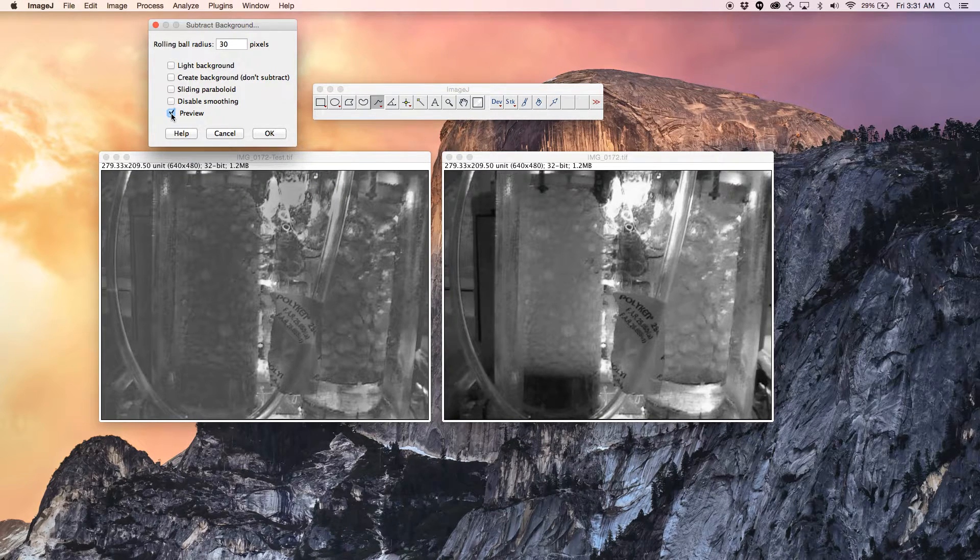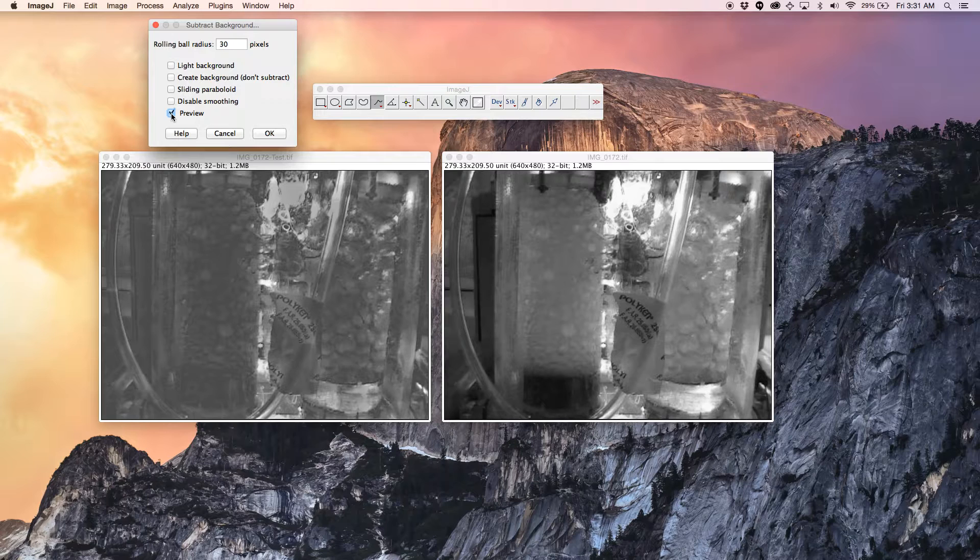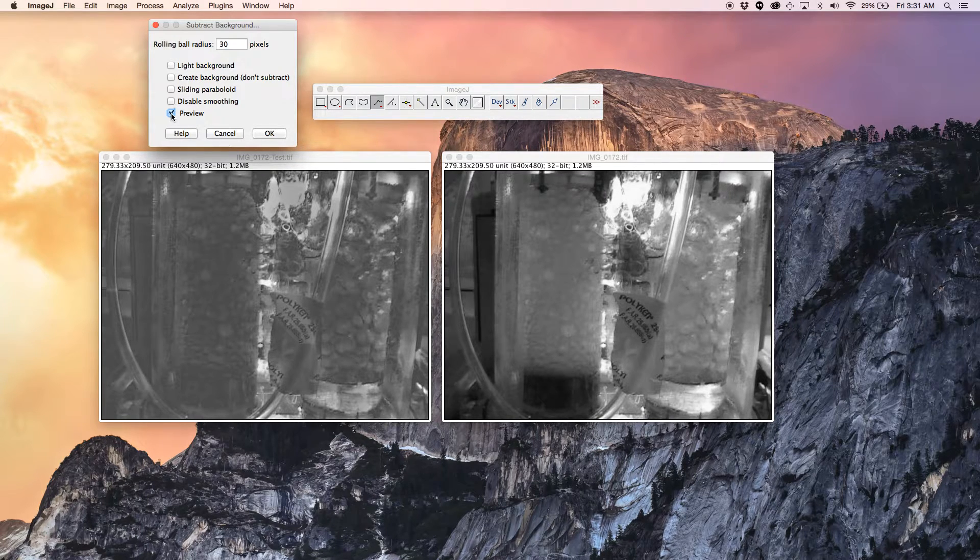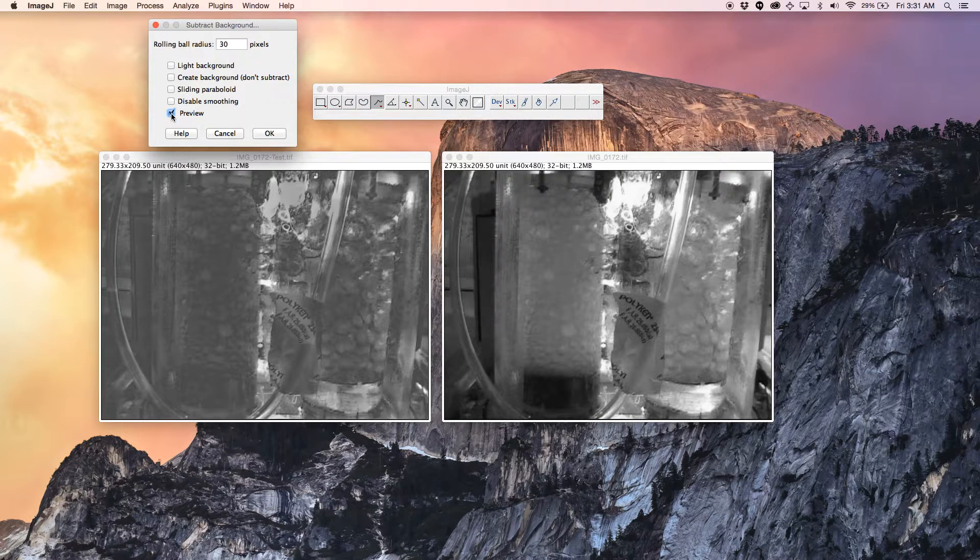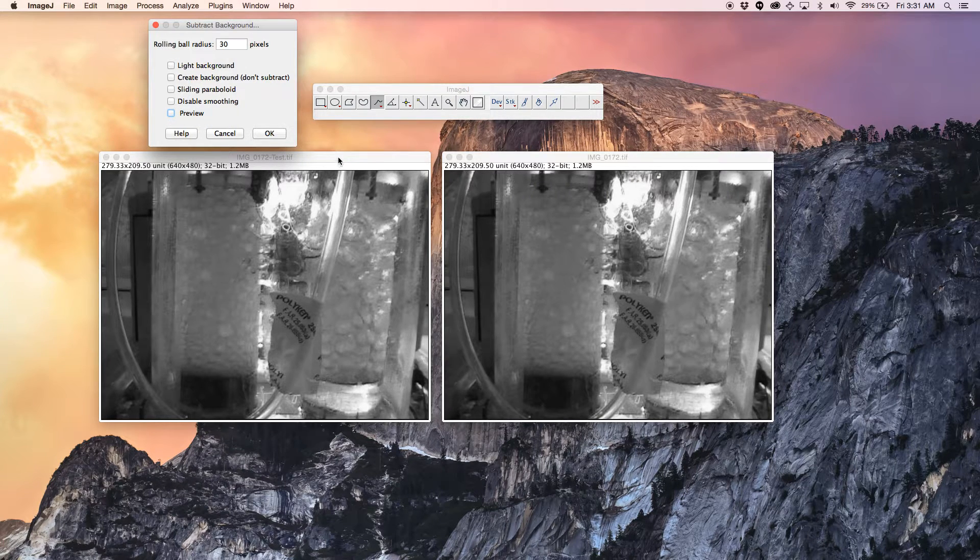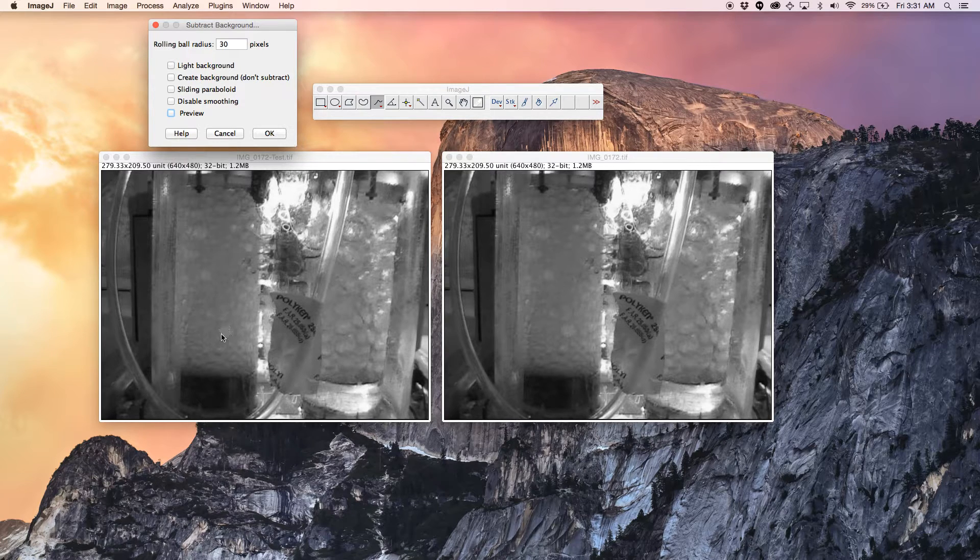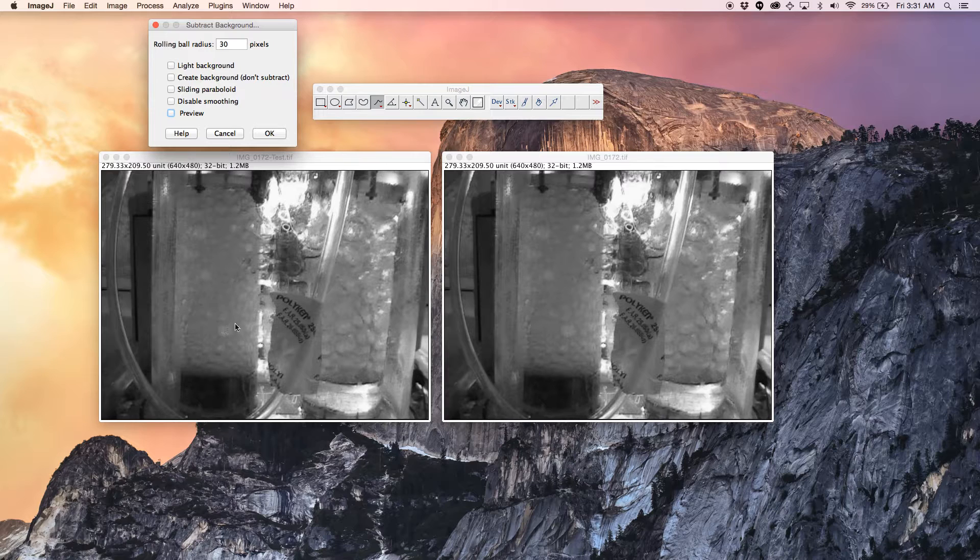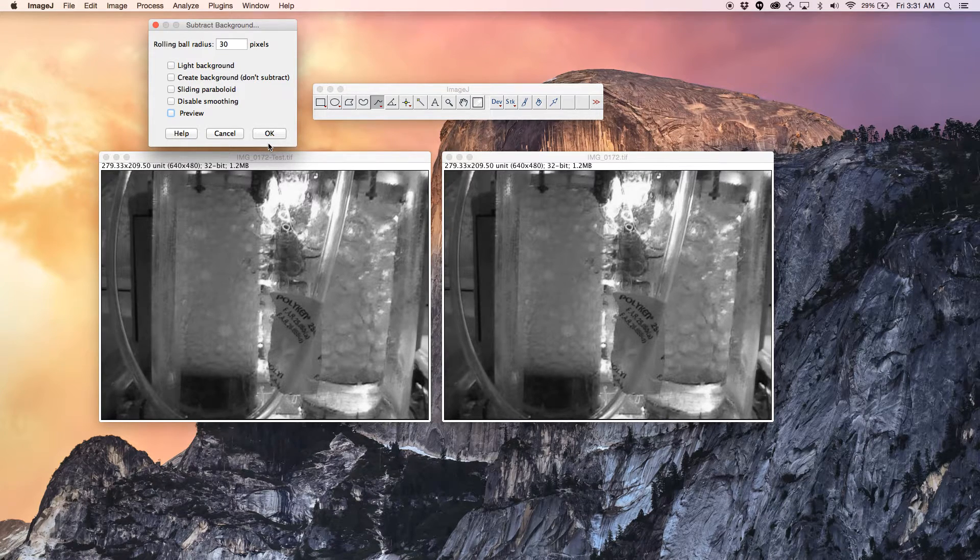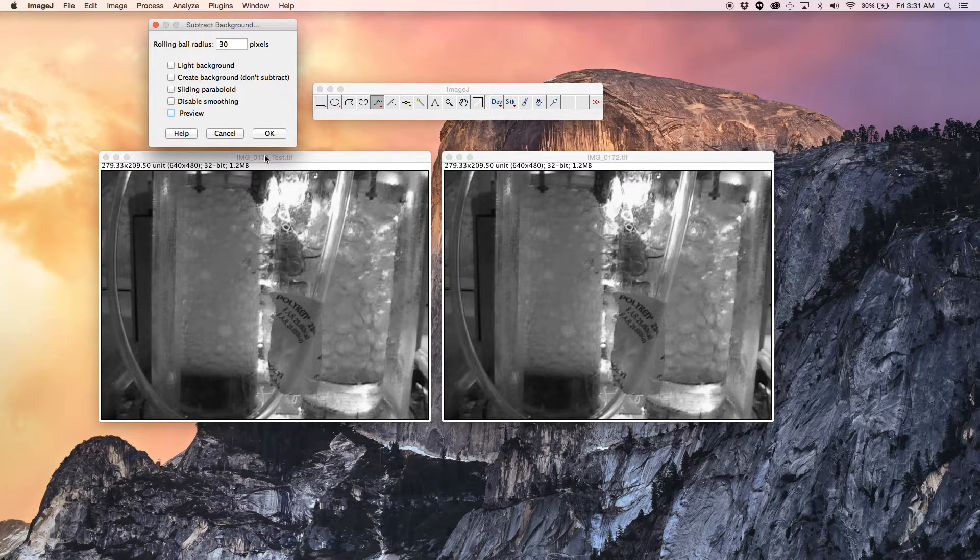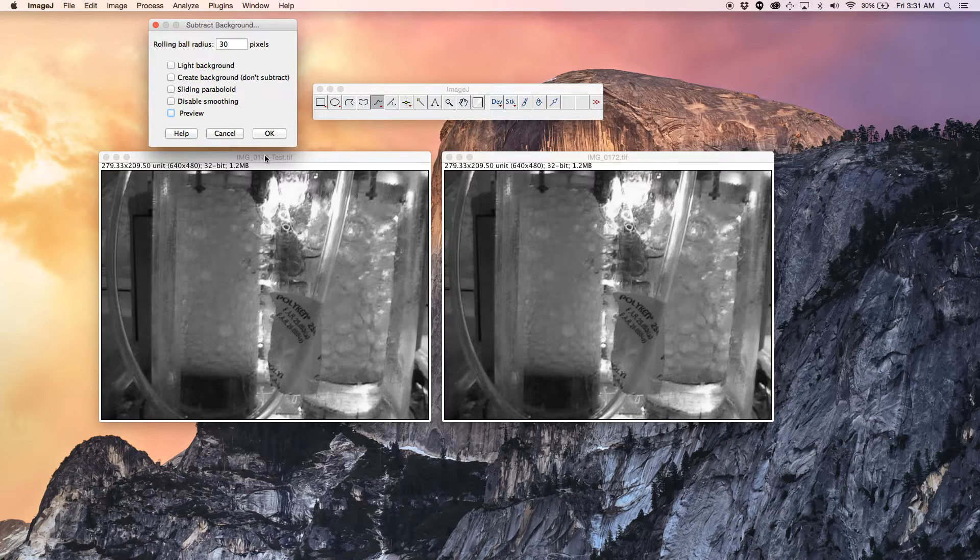And make sure that it's on. You can do it in single image. You can use the undo command if you select this one here. In case you hit OK, you'll do the subtraction, subtracting the background noise. But for single images, it's safe to do that without undo. But if you do the stack, you won't be able to go back. So make sure you just select one at a time or just process it clearly.